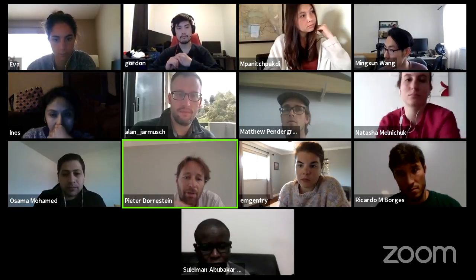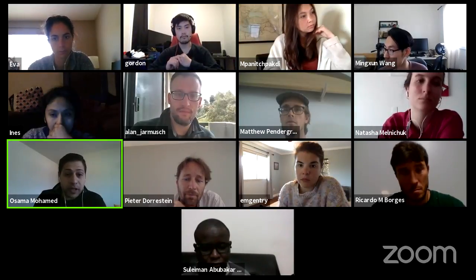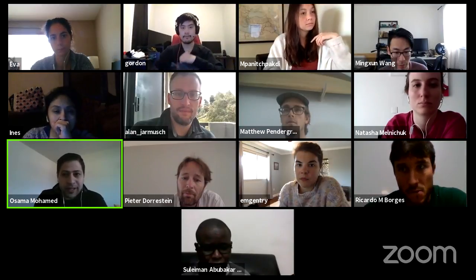But overall, using the documentation, was it pretty straightforward to begin using it or not really? No, it was nice actually. Yeah, it was nice, and it's very helpful. Thank you for that. Okay, great. And it would be great if you can involve someone also from MZmine, because sometimes I need help at the MZmine stage.